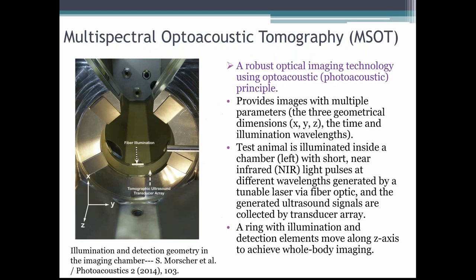In particular, multispectral optoacoustic tomography, MSOT, is a robust optical imaging technology based on optoacoustic principle. It can provide images with multiple parameters, including the three geometrical dimensions, the time and illumination wavelengths.